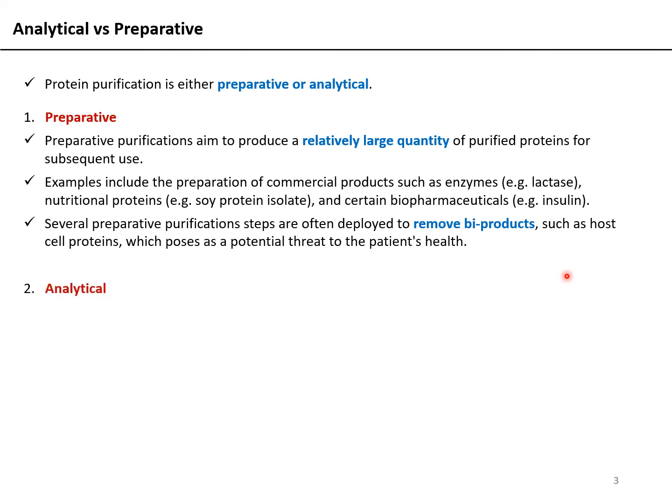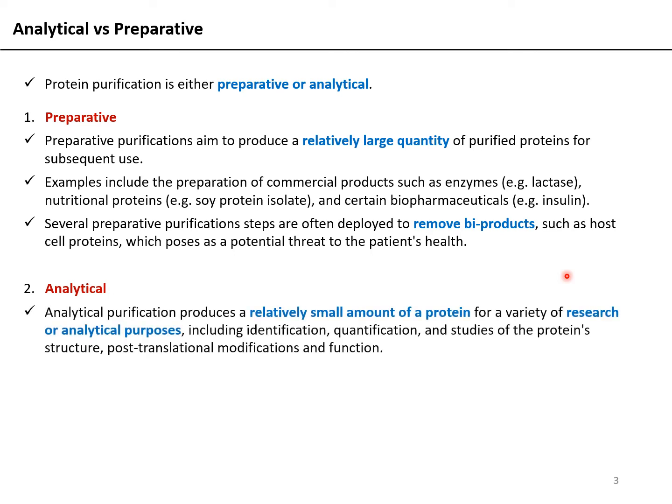Next, we have the analytical scale of protein purification. Analytical purification produces a relatively small amount of protein for a variety of research or analytical purposes.